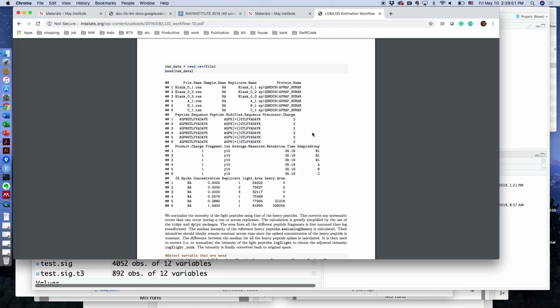So then following from that, MSstats is just going to tell us that there's a difference. It's not going to say maybe that difference is exaggerated because we're out of the range of detection. No, no, it's a kind of separate procedure.